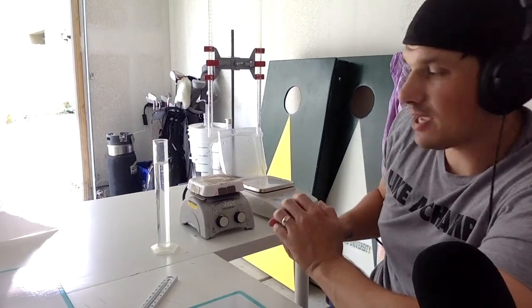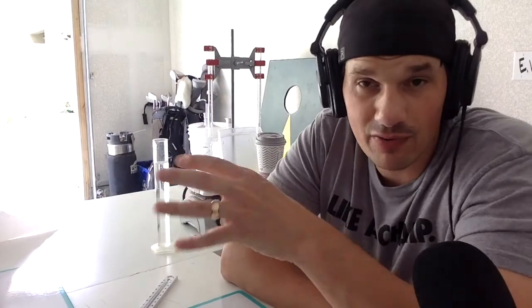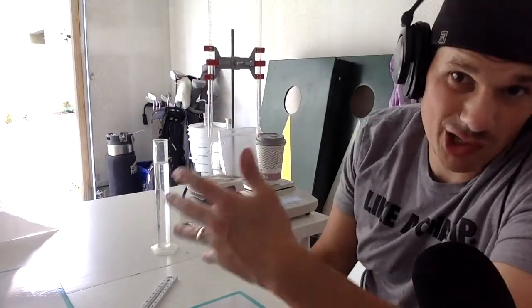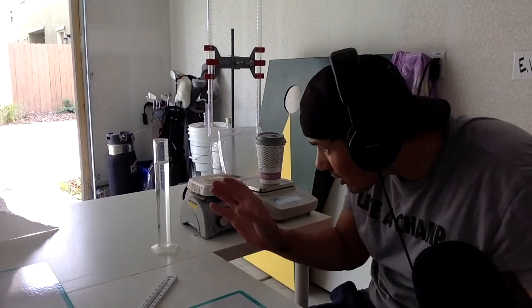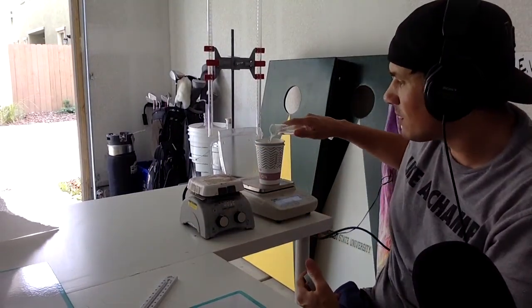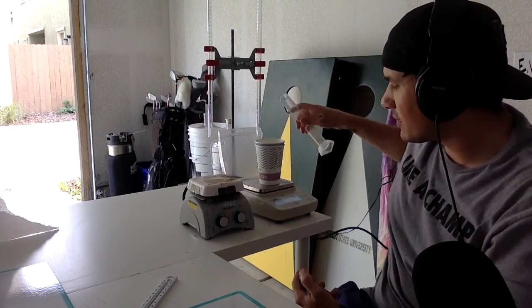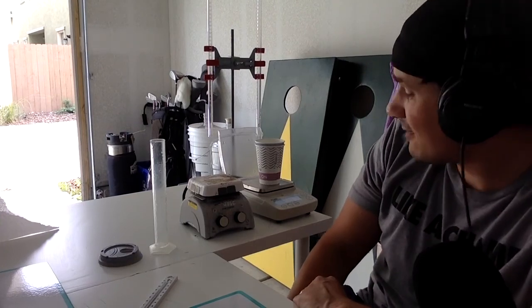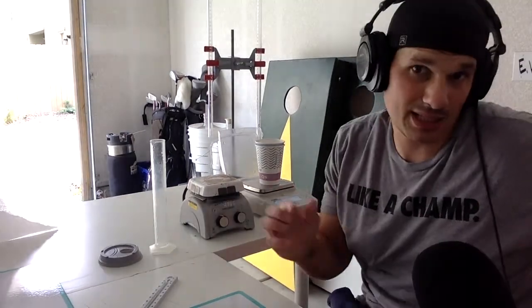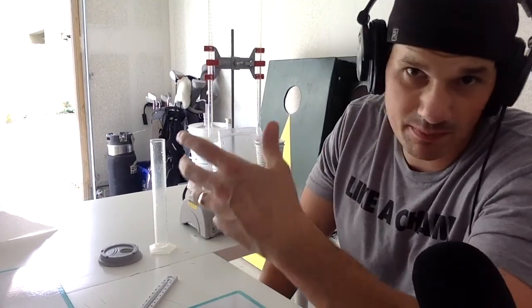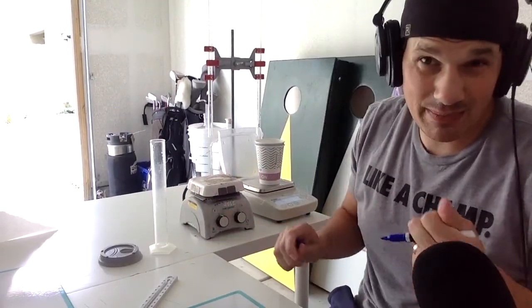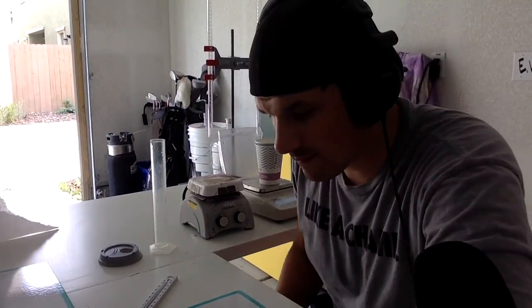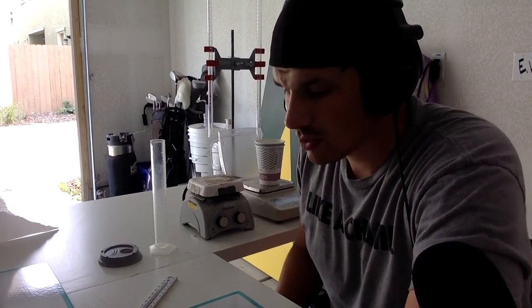So let's find this mass of water first. Prior to doing that, I'm just going to tare my styrofoam cups and lid. So I'm just going to zero out, taring means to zero out the balance. So I'm going to tare that so it's going to be a zero mass. And then I can actually weigh out my 100 milliliters of water. So I have, yeah, it looks like 100 milliliters of water. That should be about 100 grams of water as well. Assuming the density of water is one. I'm getting about 95.07 grams. Now that could just be because of the temperature. It's hot in Sacramento and this is in the garage. It's not pristine tap water. I have it bottled distilled water. So that's why it could be off. Otherwise, that's why we're getting the exact mass because I don't want to assume it's going to be 100 grams. So 95.07 grams of water.